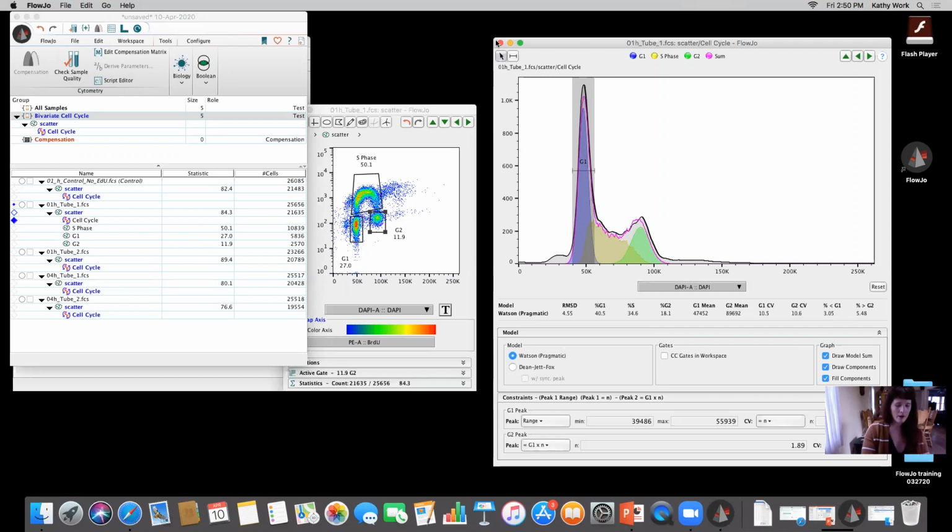All right. Maybe this might seem a little bit silly. I'm going to try drawing something because I like drawing stuff out to show people. I'm going to hold it up to the camera as I talk about it. So say you have one parent with dye, and I'm going to draw a bunch of X's, and those X's are going to equate to fluorochromes. So I'm going to draw a parent, okay? I don't know if that comes up backwards, so I apologize. But that parent has 1, 2, 3, 4, 5, 6, 7, 8, 9, 10. Nice, I drew an even number. 10 molecules of that dye.